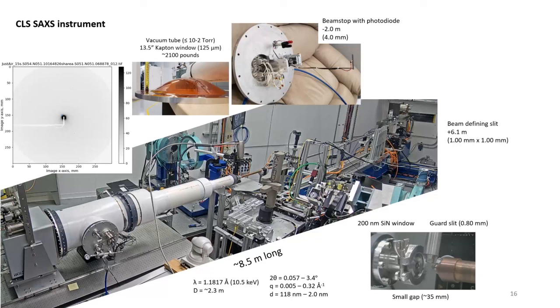But if you wanted to go higher, we could move the detector on this table to a halfway point or something. The closer we move it in, we can go to higher Q, but we also can't go to lower Q. There are beamlines around the world that do both simultaneously. They'll have their SAXS detector here, and they'll have a WAXS detector kind of close by, but not quite clipping the direct beam. So they can do both at the same time.